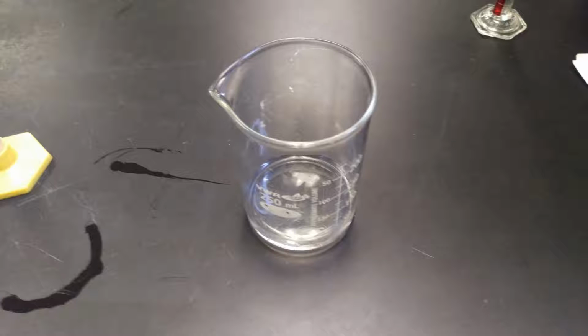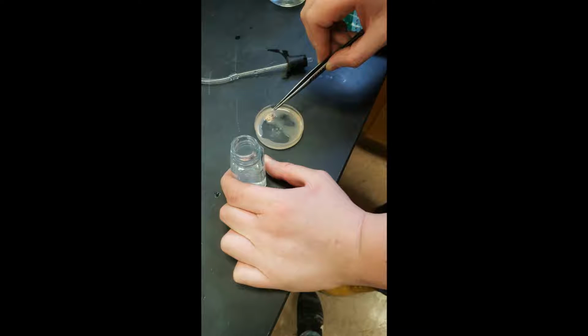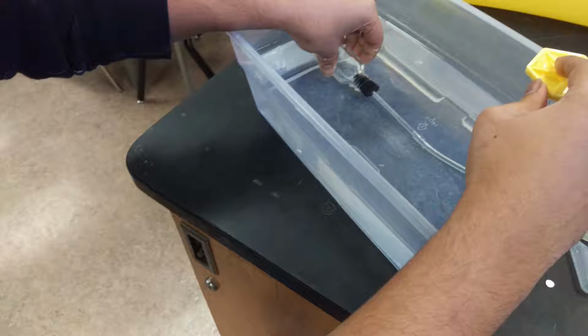For the procedure, 10 milliliters of hydrogen peroxide is added to the reaction chamber. Then a paper disc is soaked in catalase and stuck onto the wall of the chamber. To determine the catalase activity, the reaction chamber is put into a body of water with a tube leading to a graduated cylinder. Every 30 seconds, the displacement of water in the graduated cylinder is measured to determine the speed of the reaction.